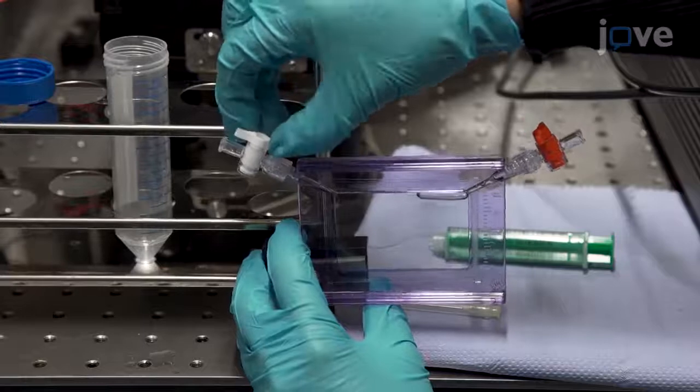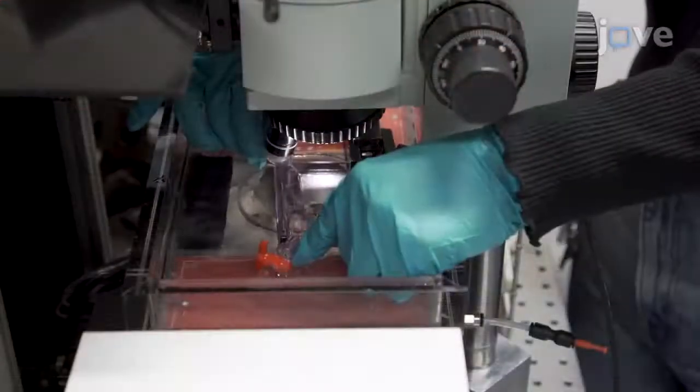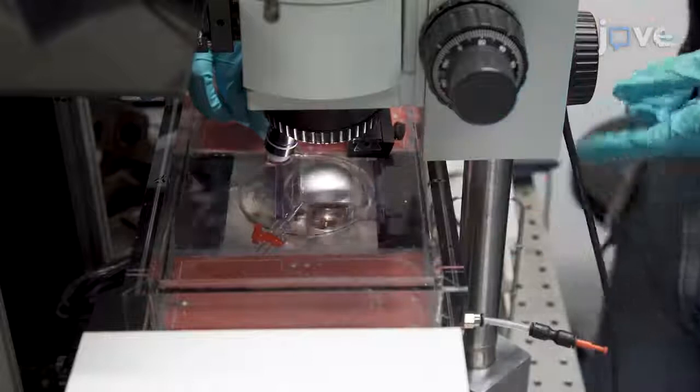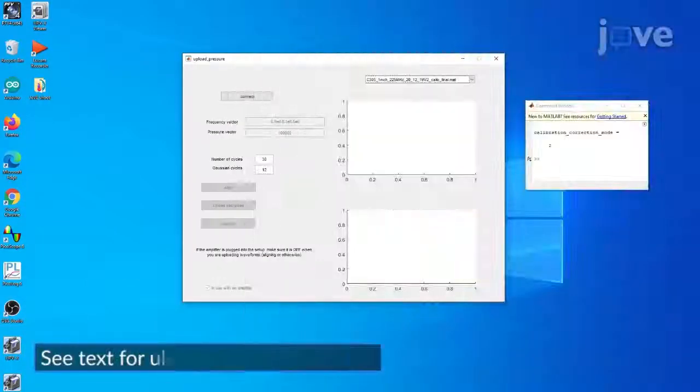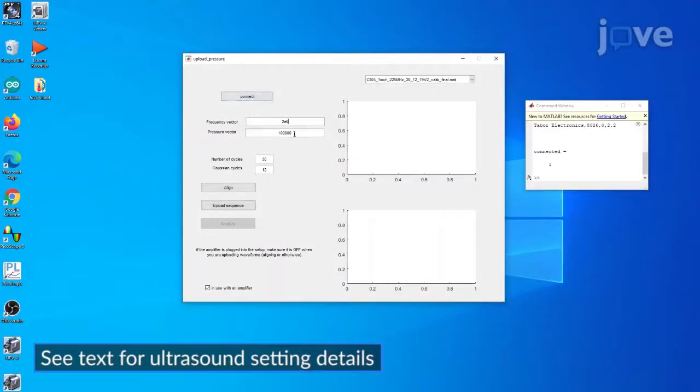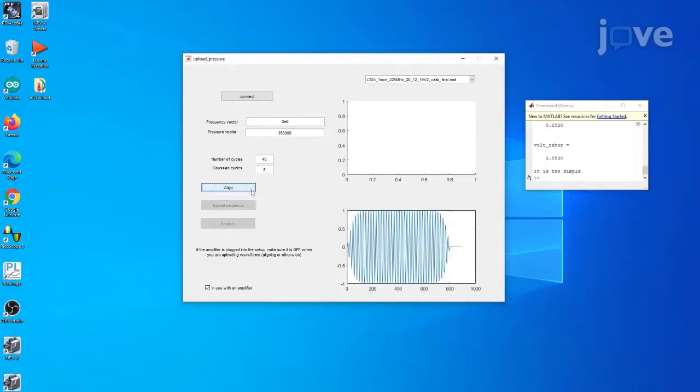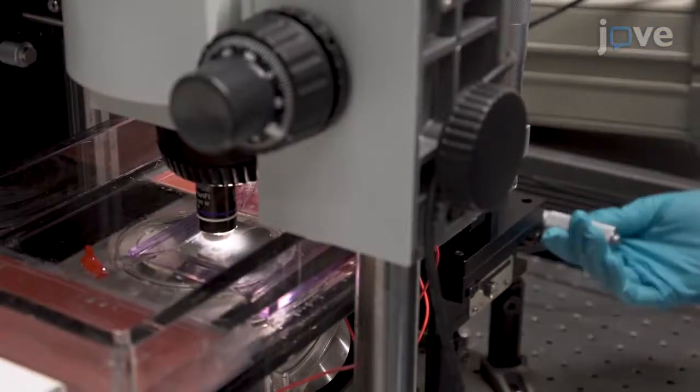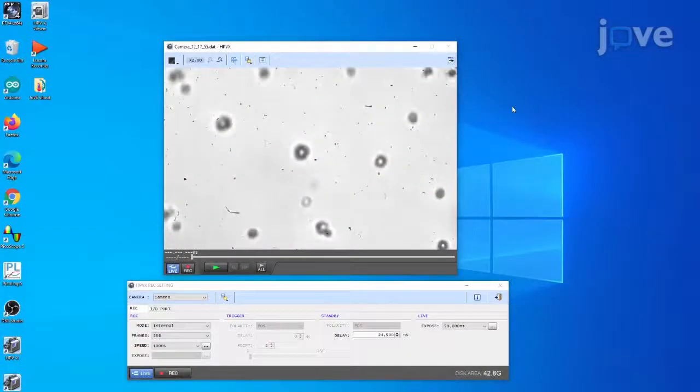Close both valves of the sample holder and place the sample holder perpendicular to the optical axis of the microscope. Before sample analysis, set the desired ultrasound driving frequency and acoustic pressure on the arbitrary waveform generator, and starting with the field of view at one corner of the sample holder, use the XYZ stage to locate single microbubbles in the field of view.